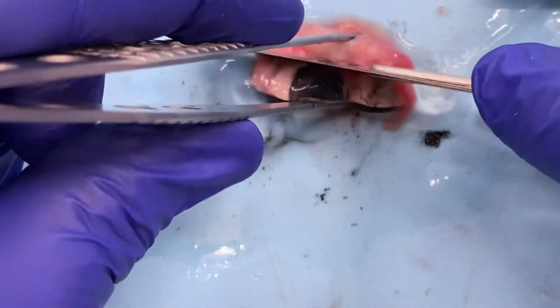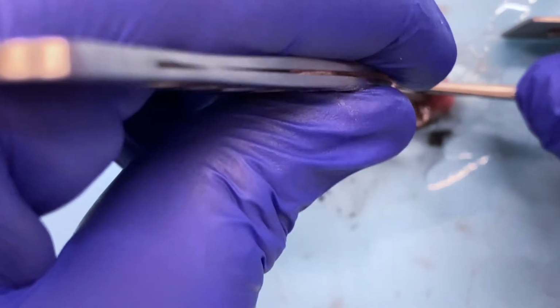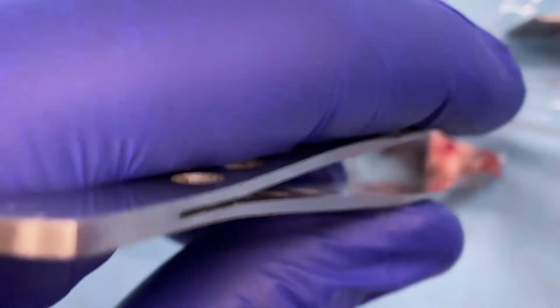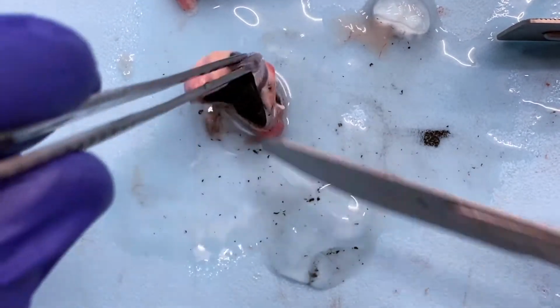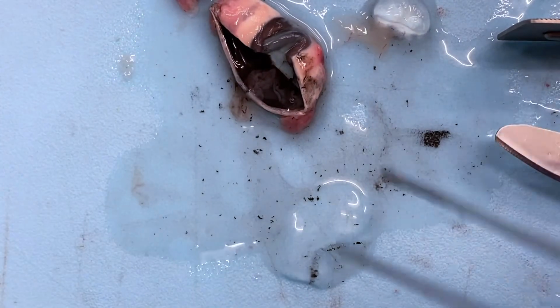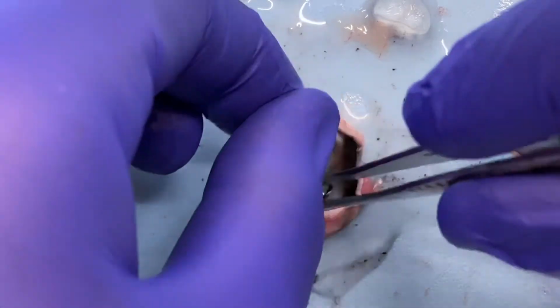There we go. Let's just use some pressure and cut. Okay. So this is a little too big for a section initially, but this is in theory what we're going for here. So let's go ahead and kind of mock up what we're ultimately going to do.